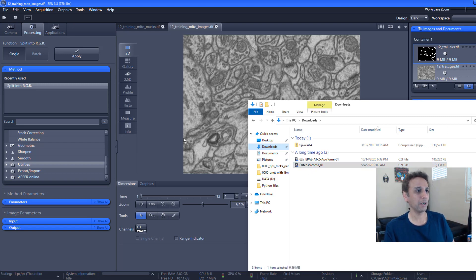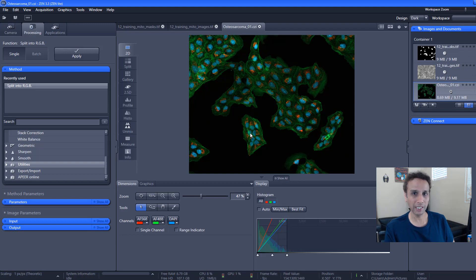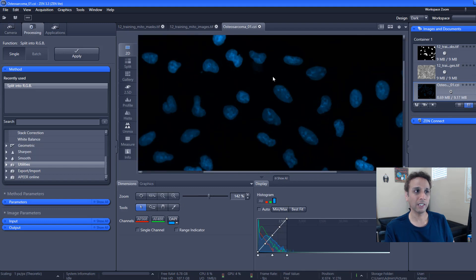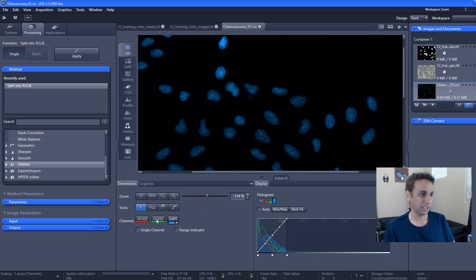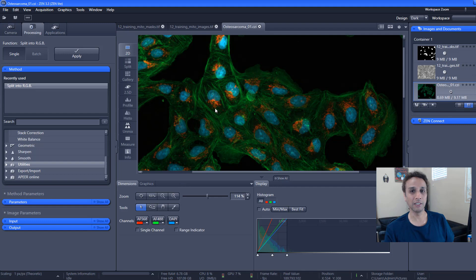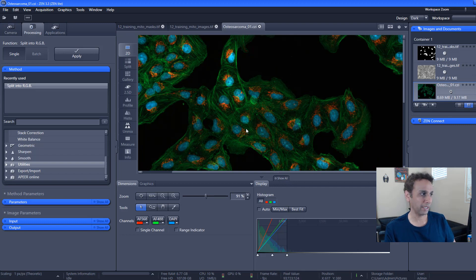Here is an image that's multi-channel. This is a typical life sciences image — it's a fluorescence image where the green is cytoplasm and the blue is nuclei. So you can just turn everything off and only look at nuclei, and you can investigate the substructures in the nuclei and everything. You can adjust basic parameters. I hope you get the idea of why I use ImageJ and Zen together. This is the free version — since I work for Zeiss I have a license for advanced features, which is super amazing, but I'm showing you all the free features you can benefit from.